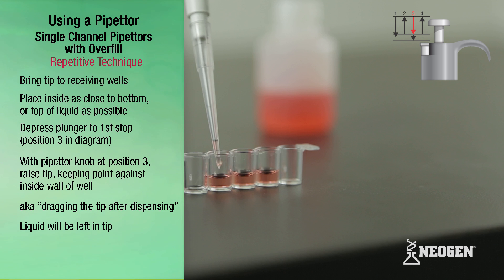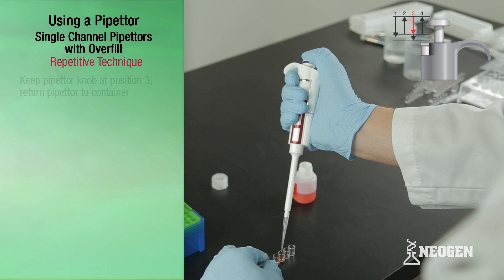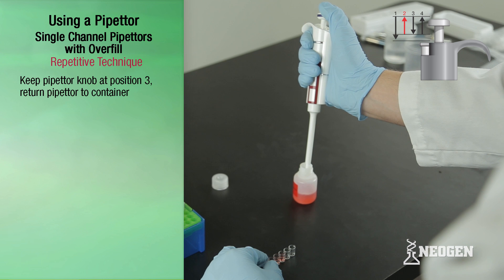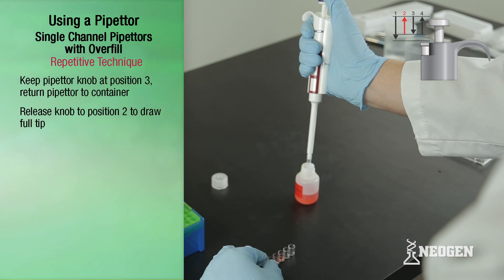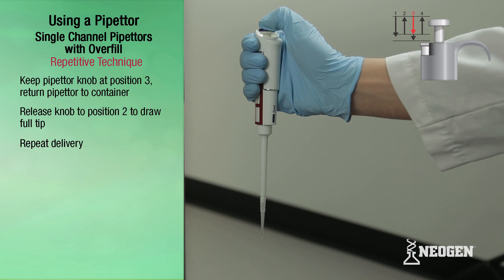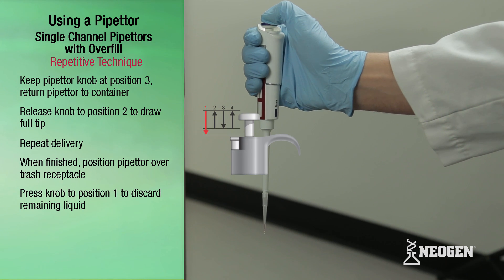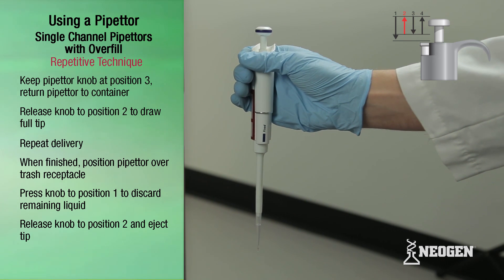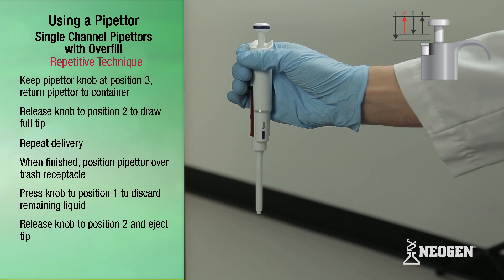Liquid will be left in the tip. Keeping the pipetter knob at position three, bring the pipetter over to the container and release the plunger knob all the way to the top — position two — to draw up a full tip. Then repeat delivery as shown. When finished pipetting, position the pipetter with tip over a waste receptacle. Press the plunger down to position one to discard the remaining liquid, then release the plunger all the way up to position two, and eject the tip.